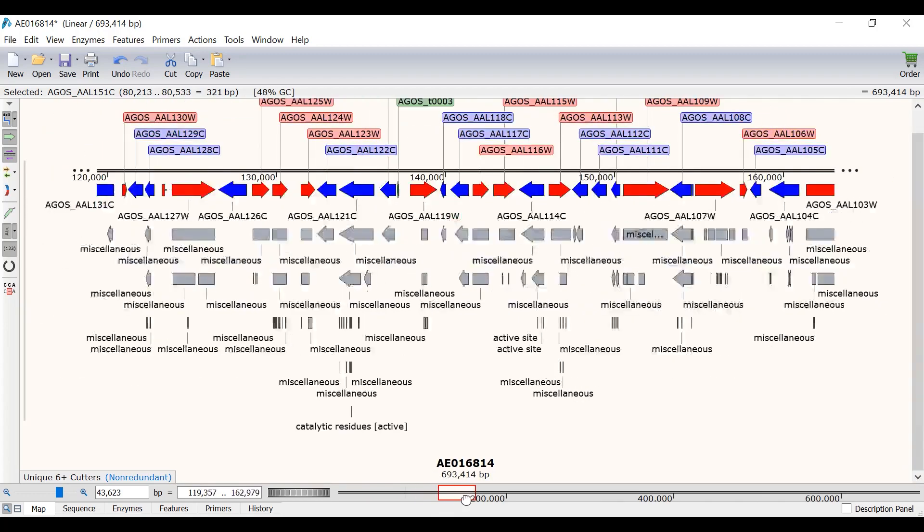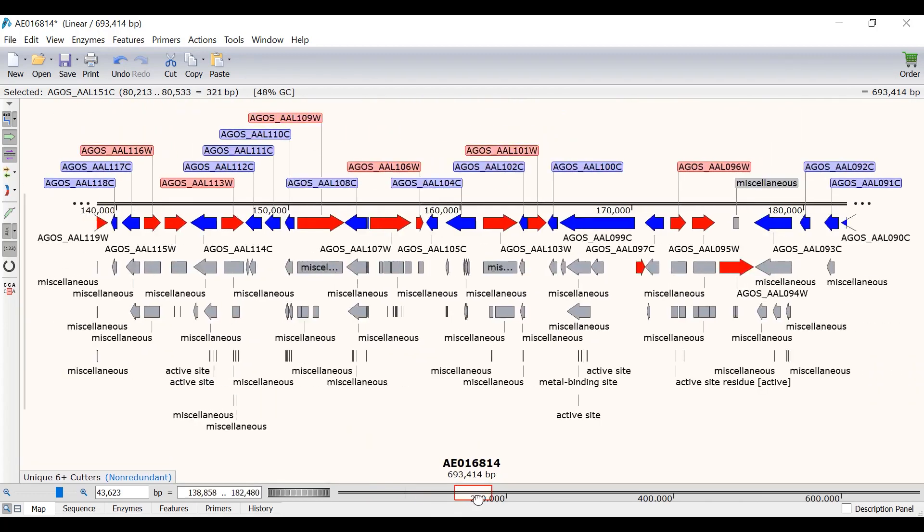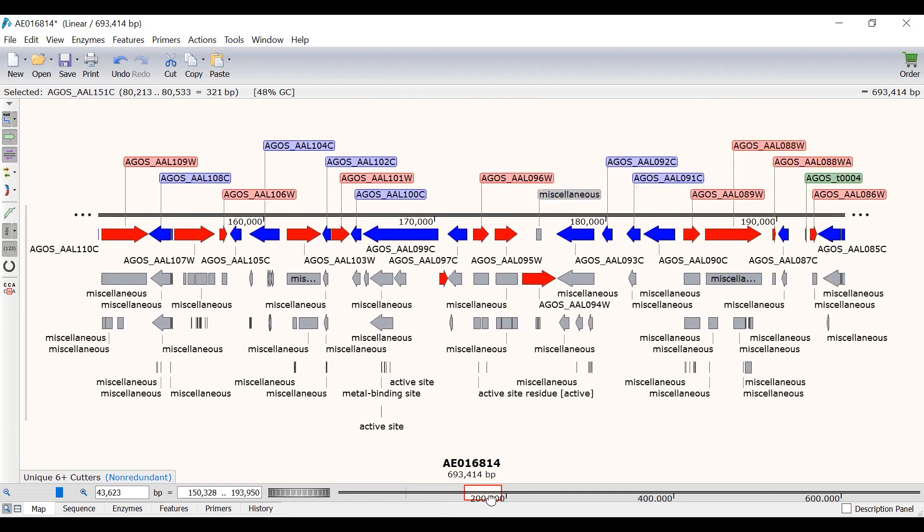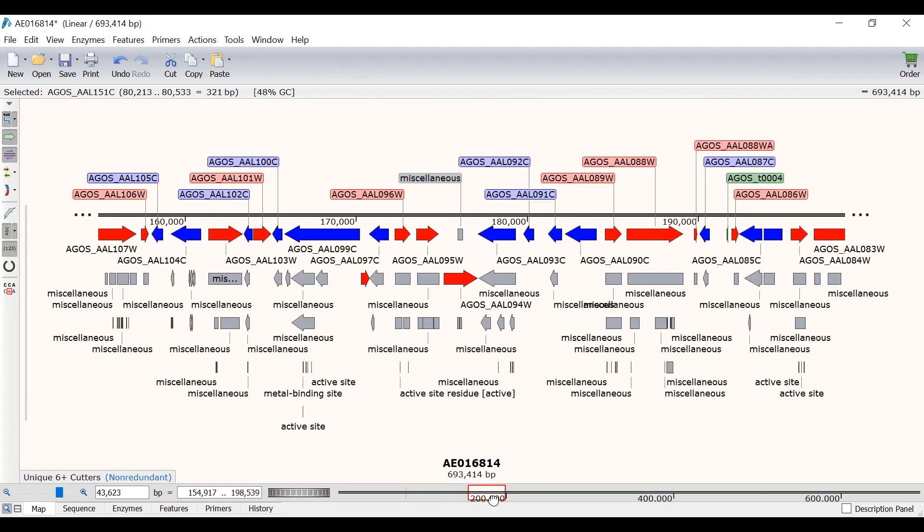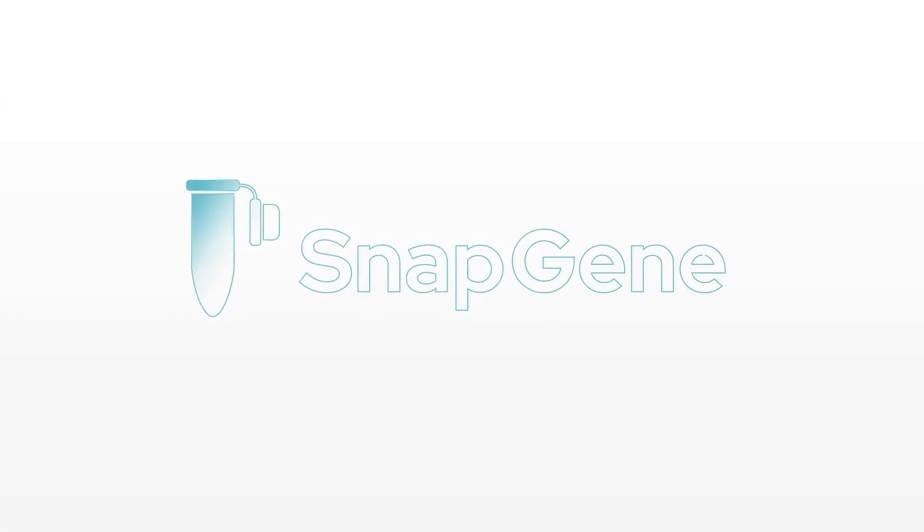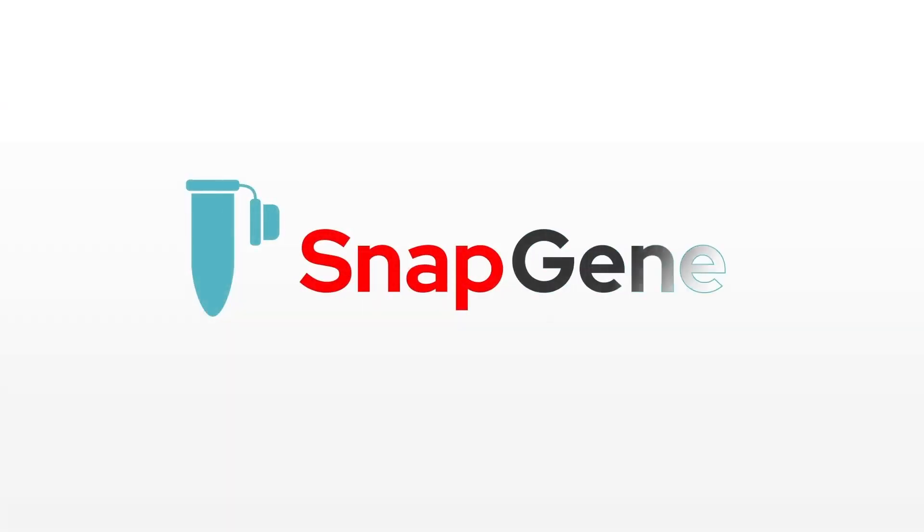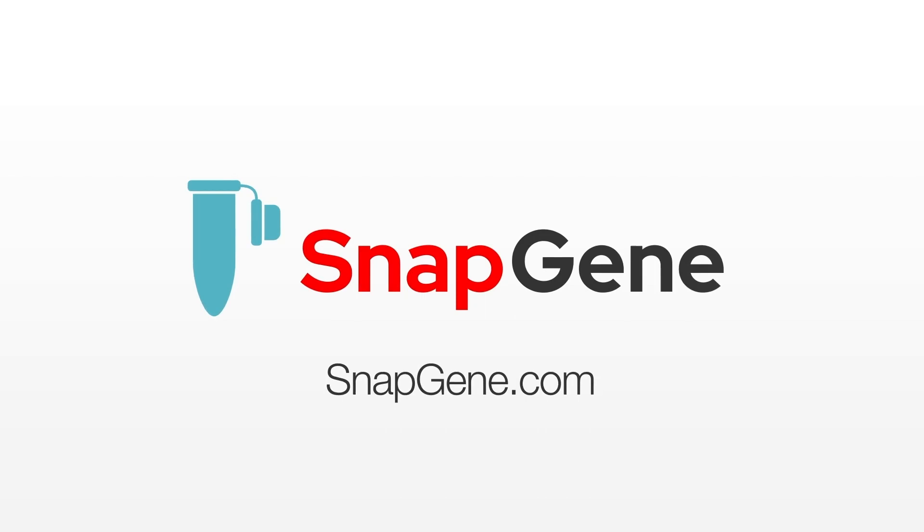And that wraps up this video tutorial. You now understand what features are in Snapgene and how you can work with features to easily annotate your sequences of interest. For other Snapgene tutorials, check out the videos on the Snapgene website.